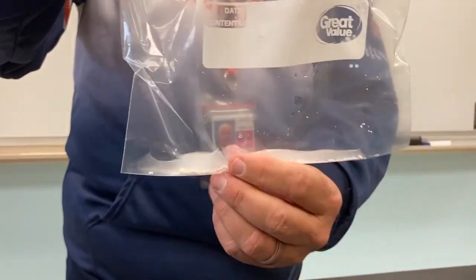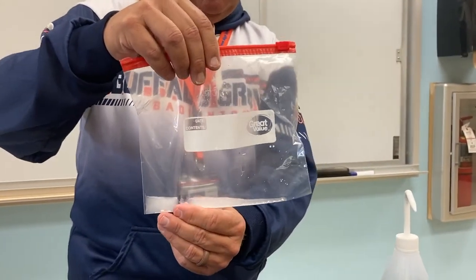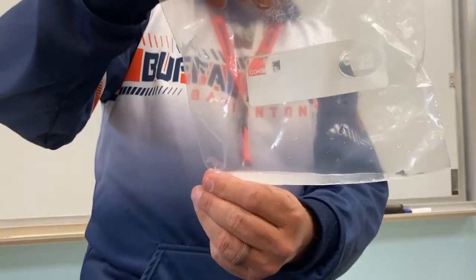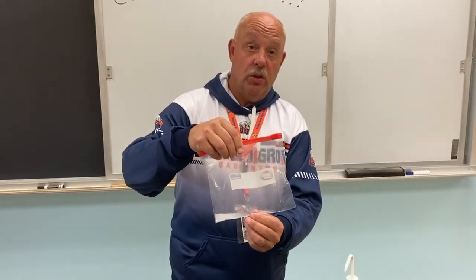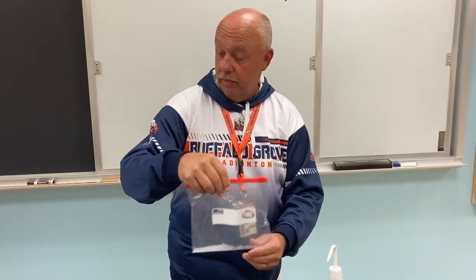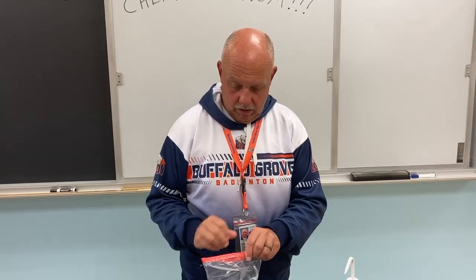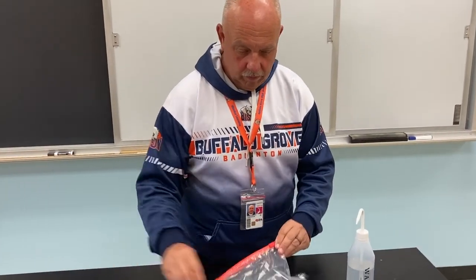What do you notice? Things are definitely in this bag getting much warmer. I don't see a color change. There's no bubbles, right? No bubbles. It is dissolving a little bit, but the temperature is certainly getting significantly warmer. Very good. If you're marking up your data table, when you put calcium chloride and just water together, we got the temperature to increase.